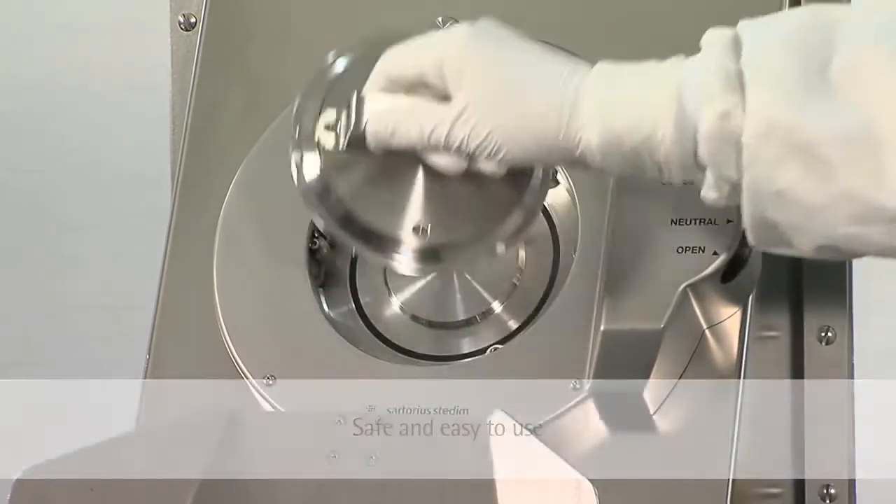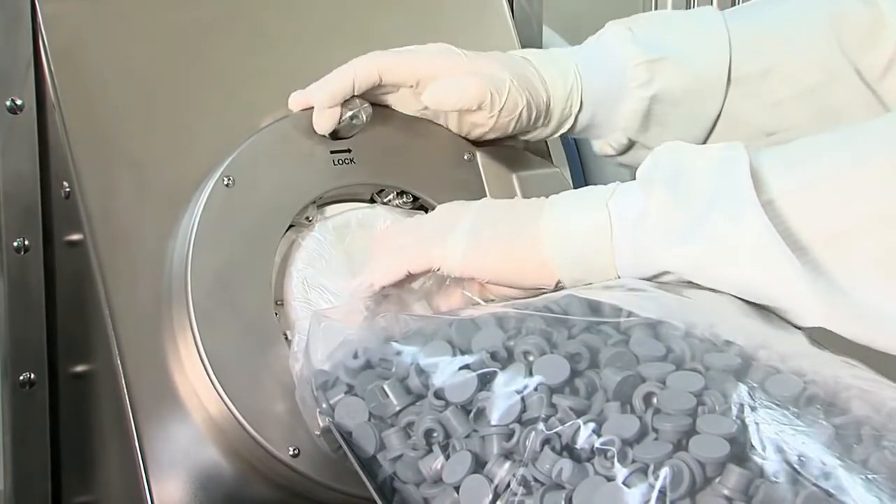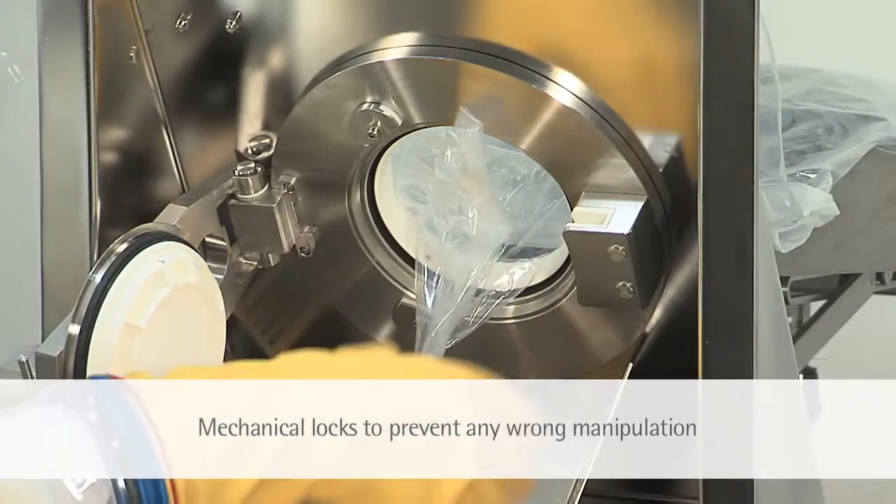Thanks to the magnetic connection, the operator easily docks the single-use BioSafe bag onto the BioSafe monolever port. The mechanical safety locks guide the operator through the different transfer steps.